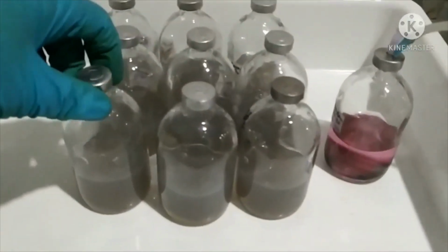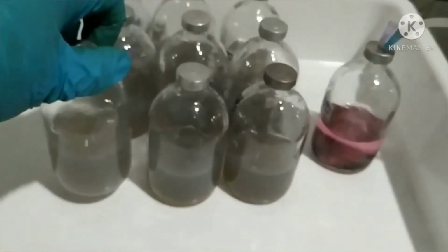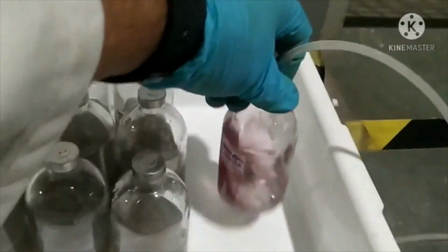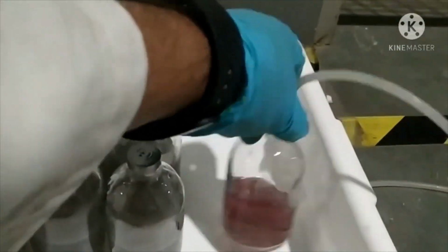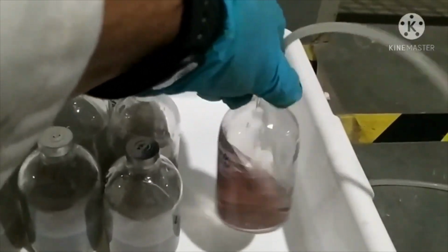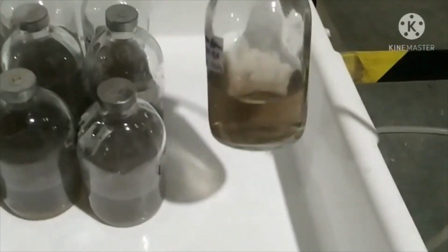You can see we have done the purging with all the samples, and now there is no color change after the mixing and all. This means the condition is fully anaerobic, and we are just completing the last one, and it is also showing the disappearance of the color. It has totally disappeared now.